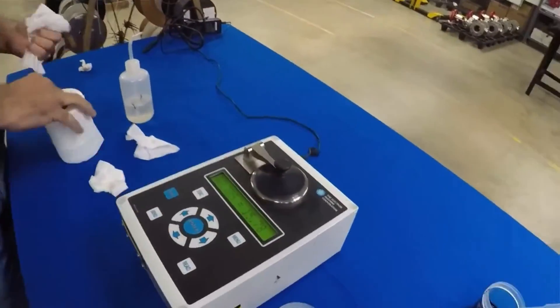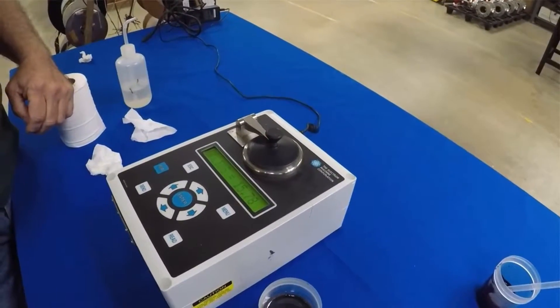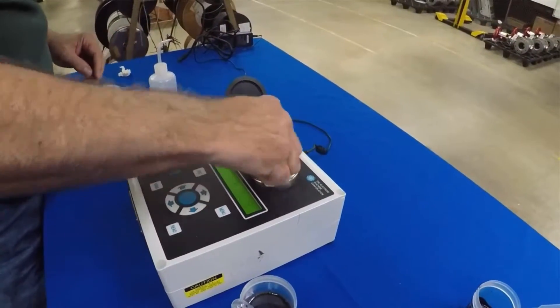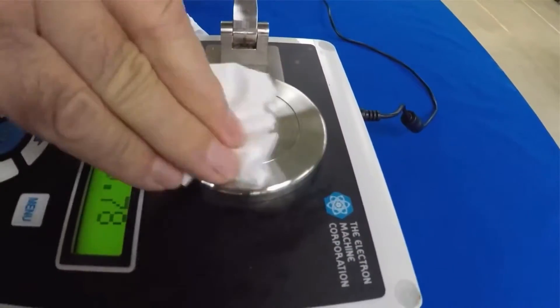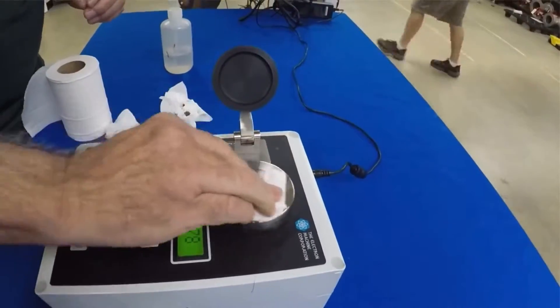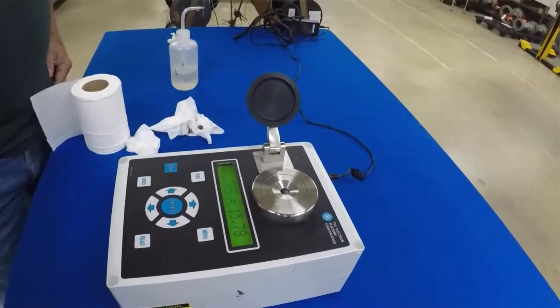Now we're going to clean the sample off. You basically repeat the process with paper towels or toilet paper and just wipe it off. Clean it with water, and you want to make sure you wipe around the edge pretty well to ensure that there's no black liquor left on the edge.